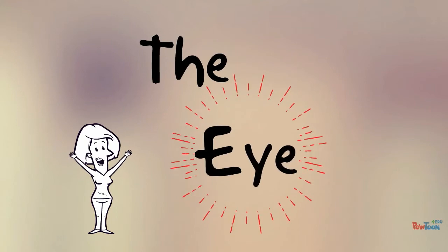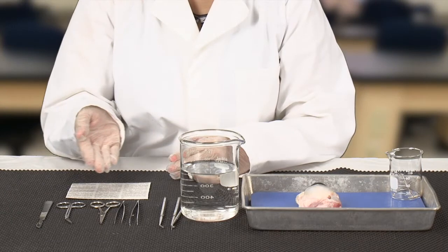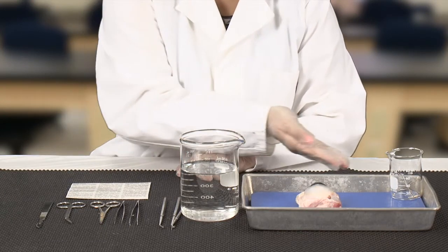The eye. Materials: dissecting tray and tools, newspaper, beaker with water, preserved cow eye.